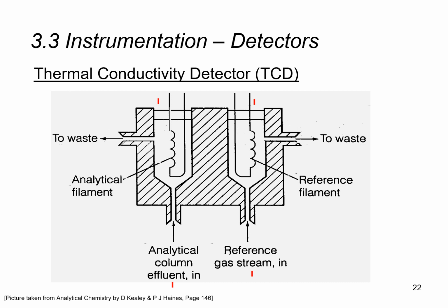But what if suddenly during our analysis we start to have different types of gas molecules eluting from the column and passing into the detector? For example, you can imagine, what if ethanol gaseous molecules start passing into the chamber on the left? If the chamber on the left is now filled with ethanol molecules, obviously ethanol has a different thermal conductivity from nitrogen, right? So it conducts heat differently from nitrogen. So what will happen to the filament in the left chamber?